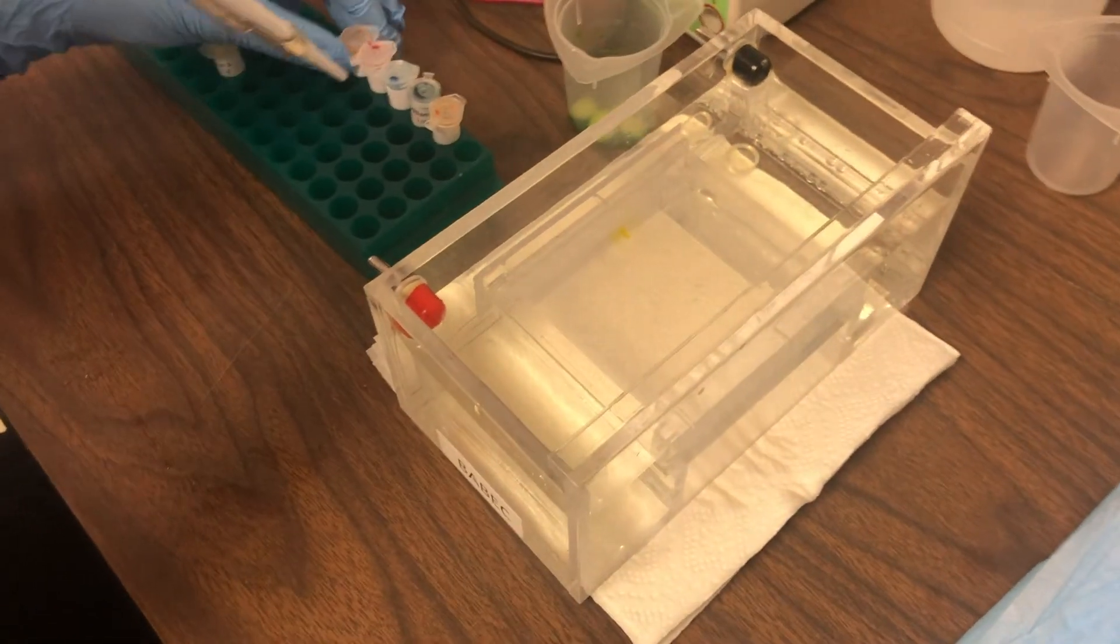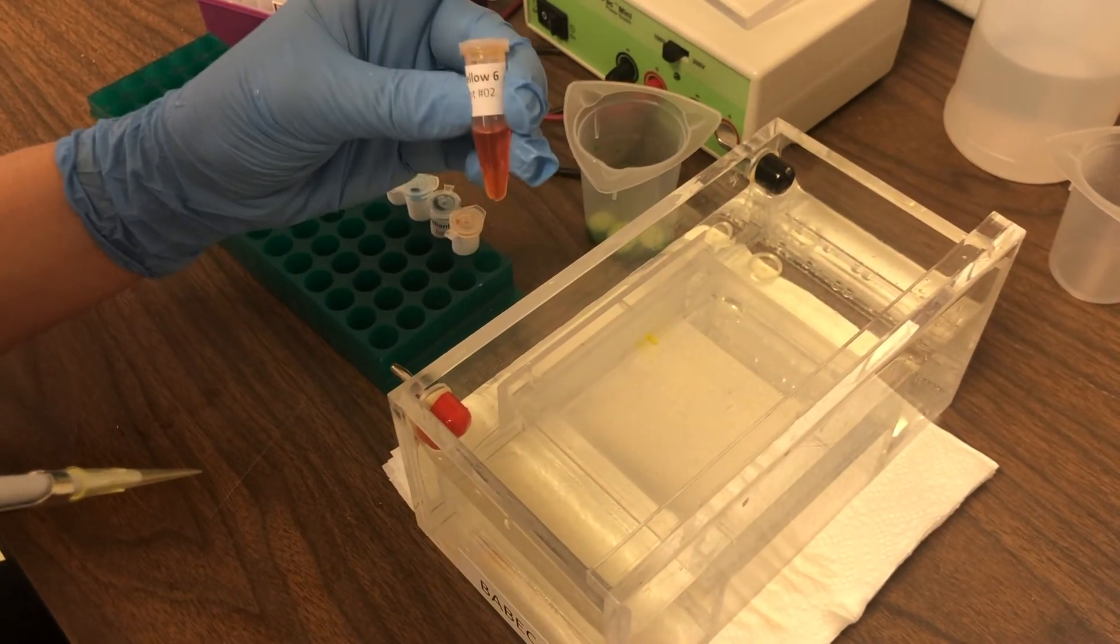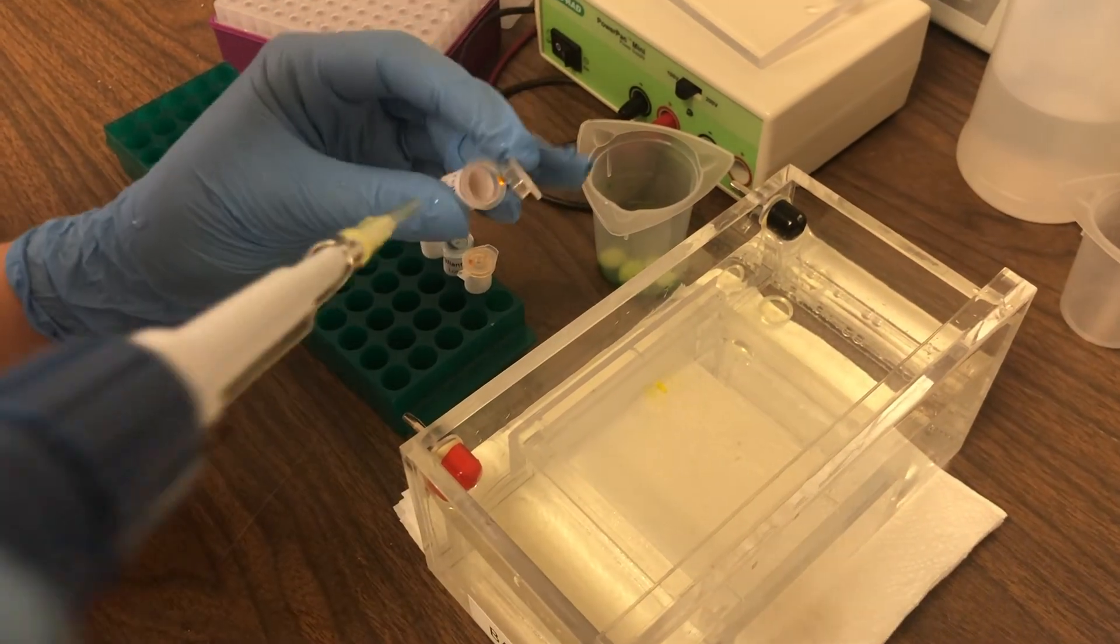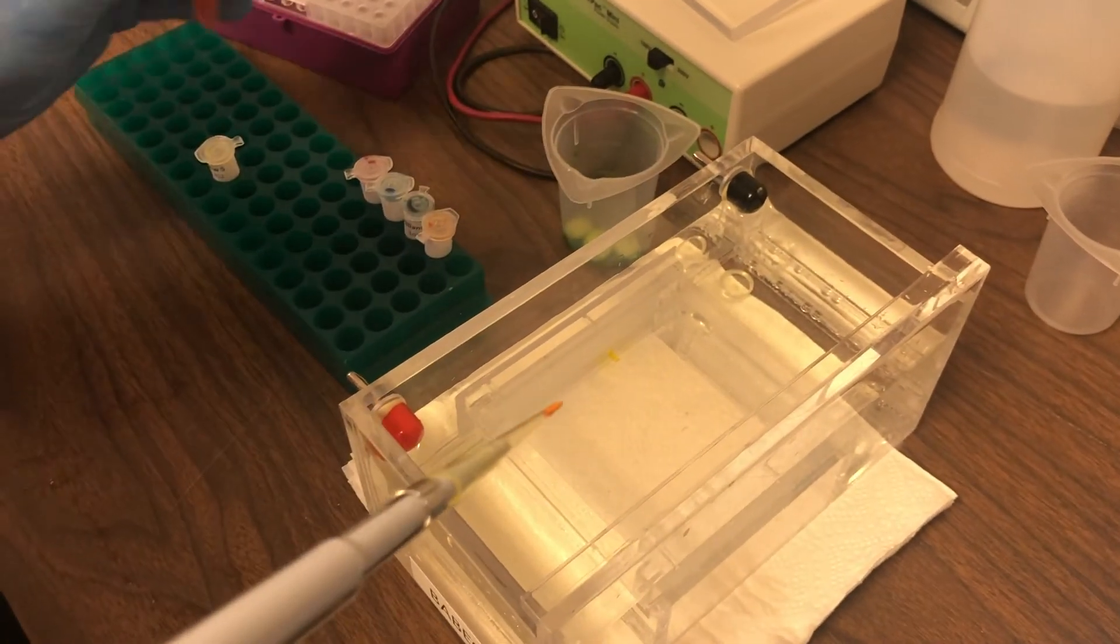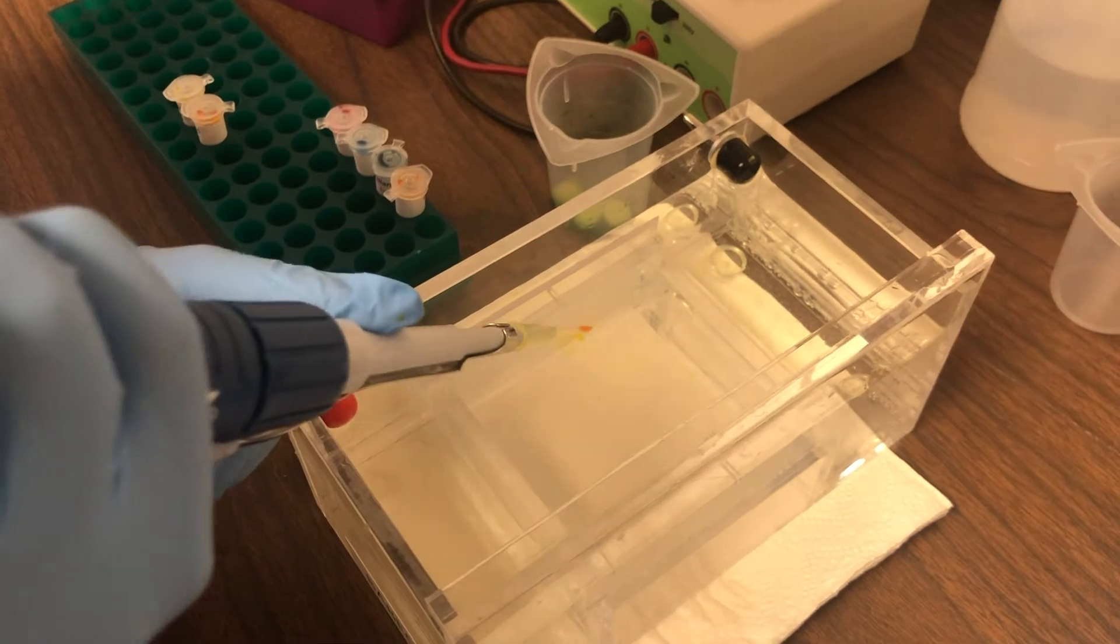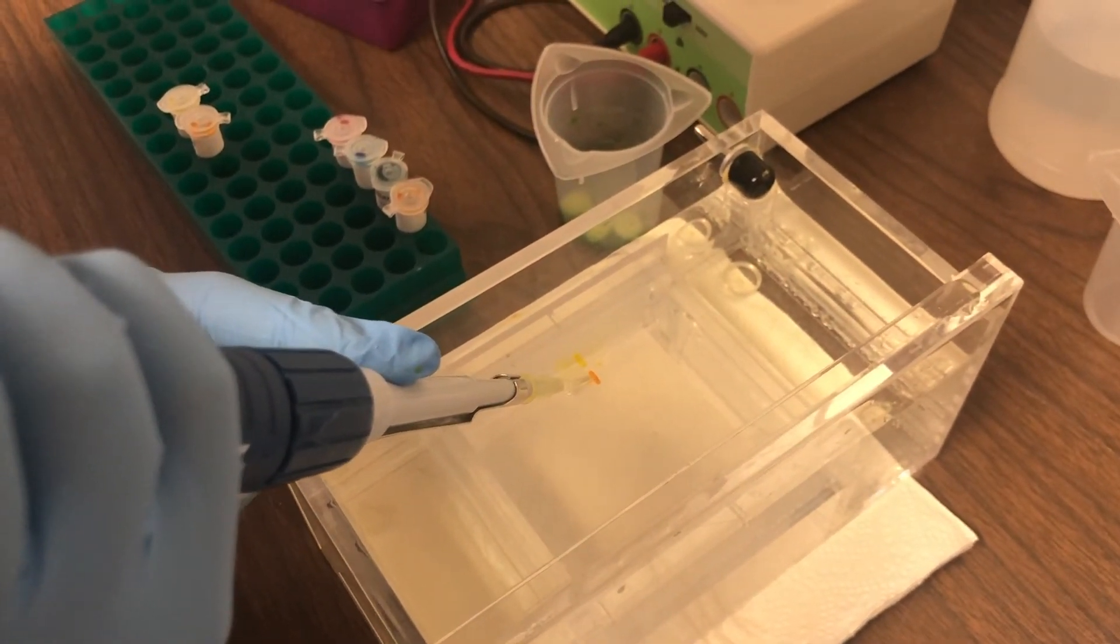Get a new one to add our second sample. In this case, it's yellow number 6. Now, you'll see when we load lane number 2 here, you often want to use, if you're right-handed, your left hand on the box to steady your right hand for loading the gel.